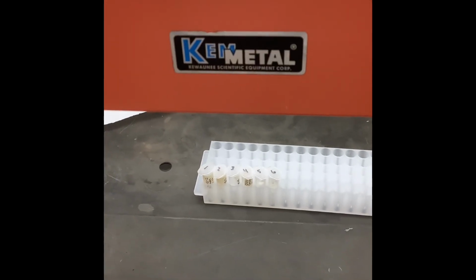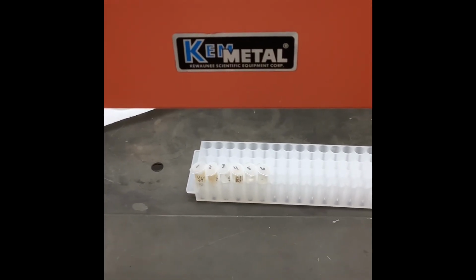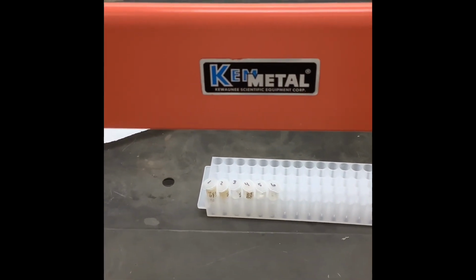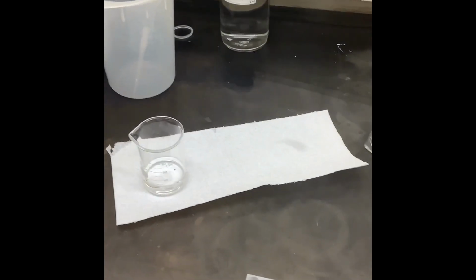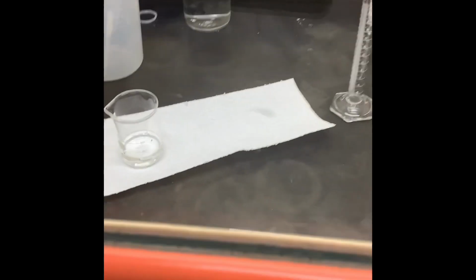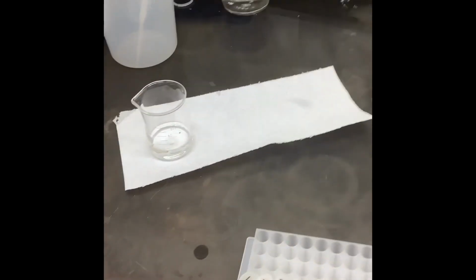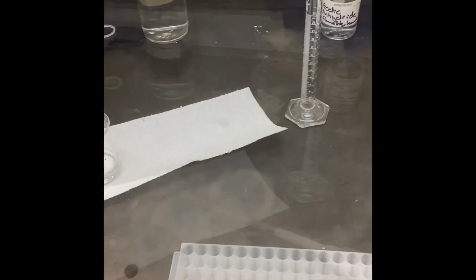I also have my samples ready to start. Make sure if you prepped your samples ahead of time, you have the date that you're acetolyzing them in the spreadsheet. The first thing that you're going to do is open all your samples, and add 1 milliliter or 1000 microliters of glacial acetic acid into each tube. Then you're going to centrifuge all of the samples at 1060 G for 3 minutes.